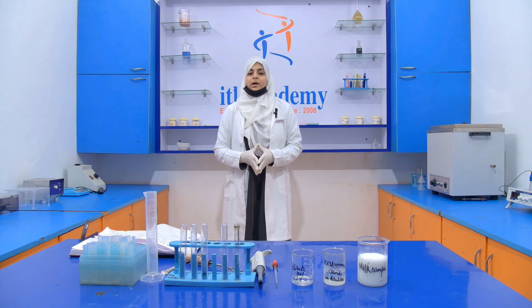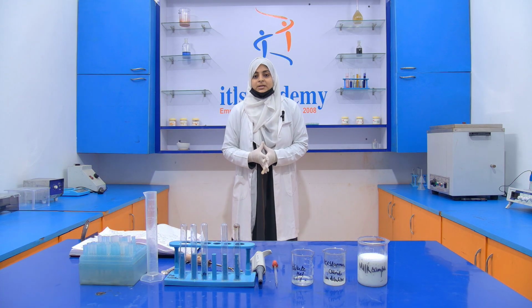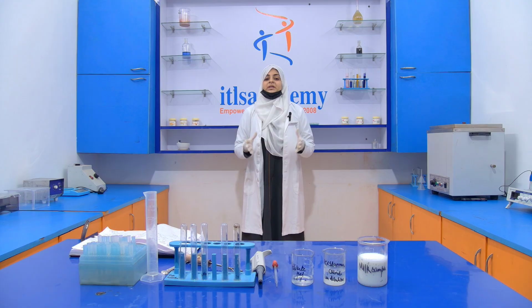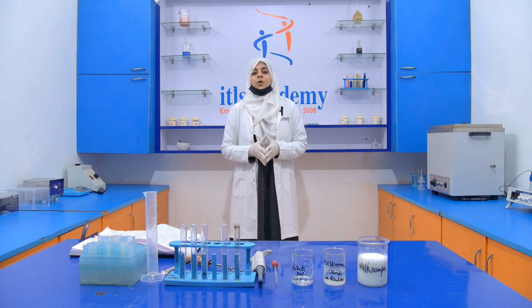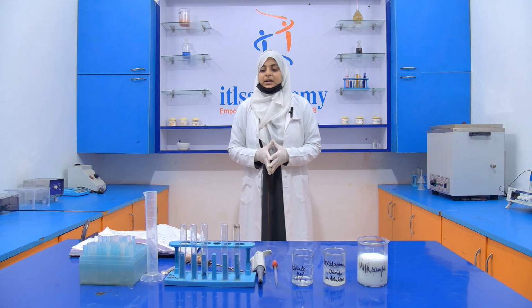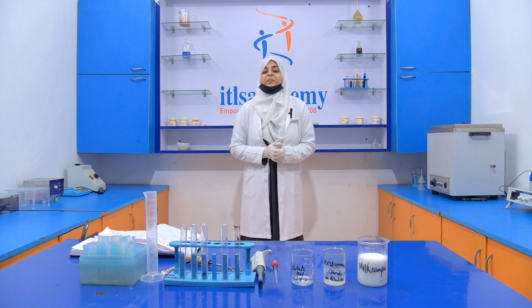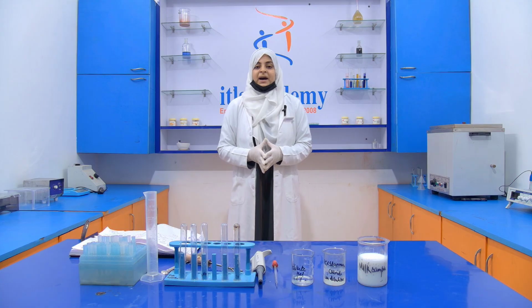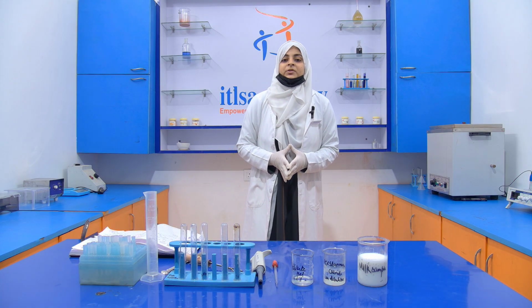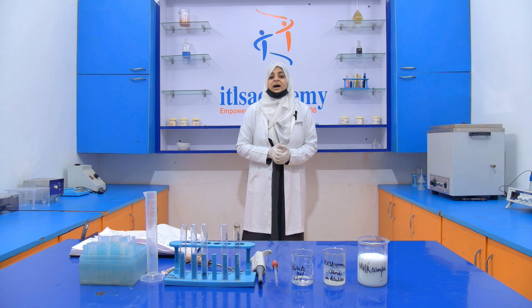Today we are going to perform another experiment, that is the detection of the preservative. Here the preservative that we are going to detect is mercuric chloride. So before starting the experiment, we have to know what this preservative is.